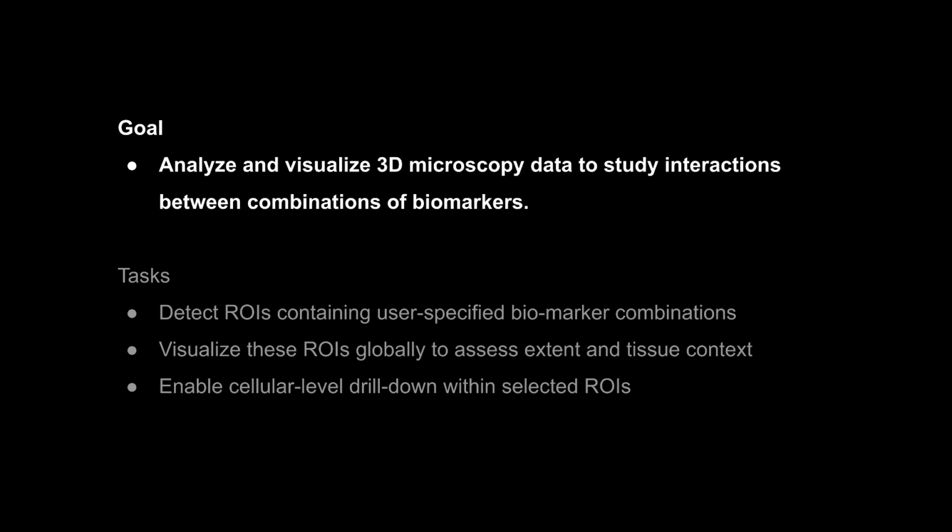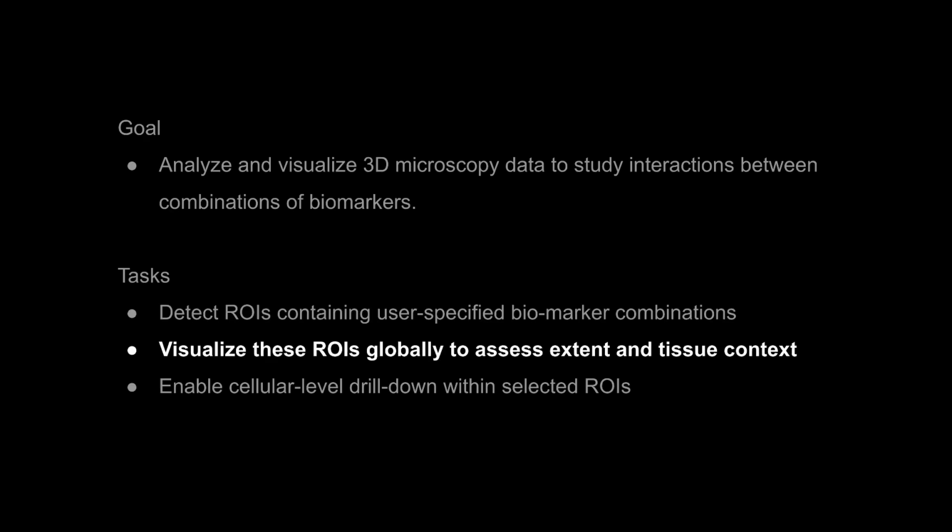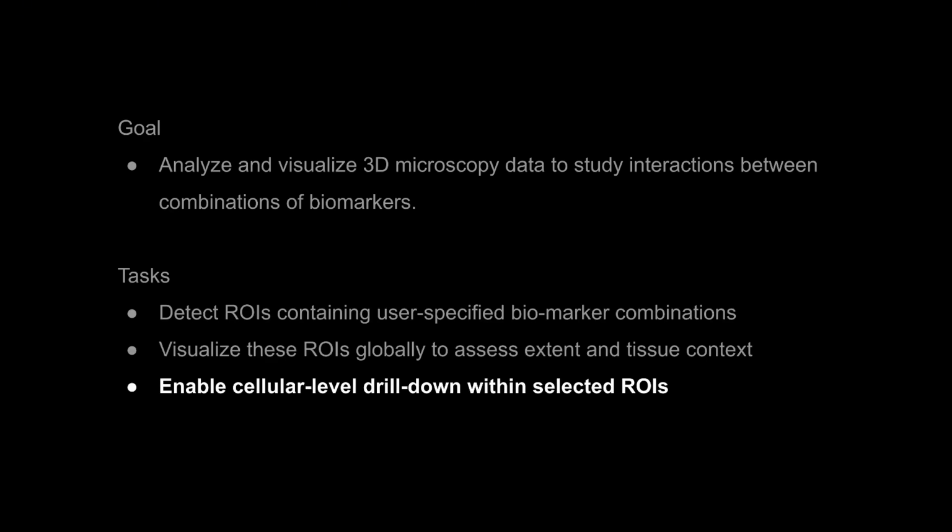Our goal is to analyze and visualize 3D microscopy data to study interactions between combinations of biomarkers. Our approach tackles three main tasks: detecting regions with specific biomarker combinations, showing these regions in the global tissue context, and enabling detailed exploration at the cellular level.